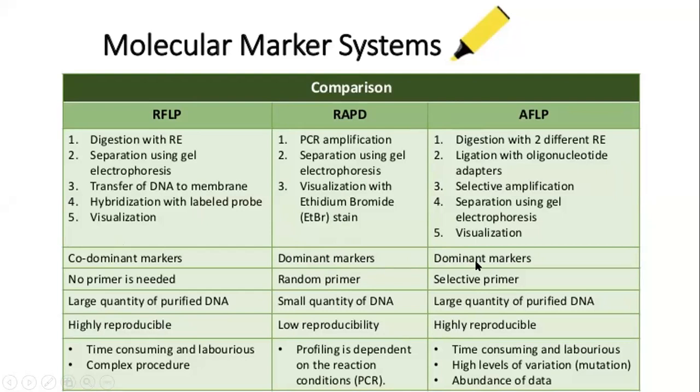It doesn't care how many restriction sites there are or what is in there. In AFLP, it will cut at the restriction site, and you take site 1, site 2, and between that is genomic DNA. Here it doesn't take restriction enzymes. You give primers, and it blindly amplifies the region in between. So based on this, you cannot distinguish. The methodology inherently cannot distinguish any changes in between.